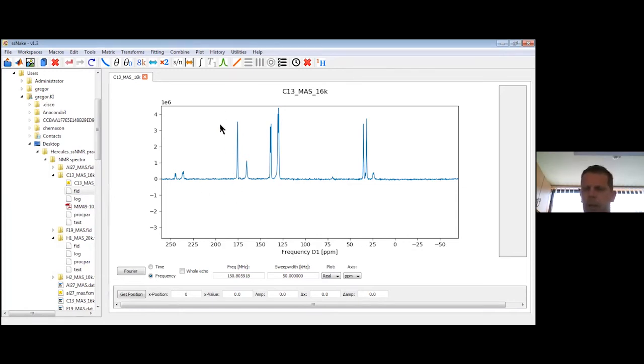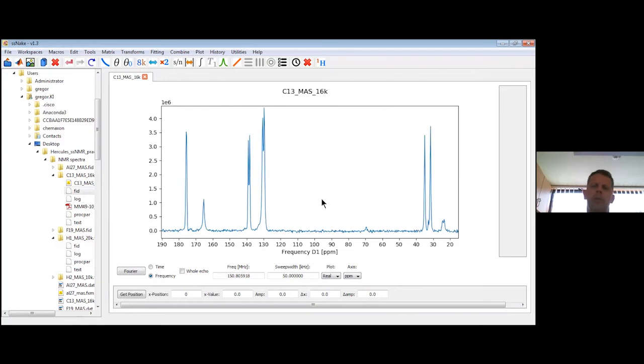So I will zoom it in. And I would also like to mention here that typically NMR signals of carbon nuclei fall between 0 and 200 ppm, rarely out of this area. We have some signals over here in this particular case, but these are actually the spinning sidebands that belong to these 2 signals. And we have spinning sidebands also here below and here below. So I will just zoom to this part for now, which is, let's say, the most informative for us.